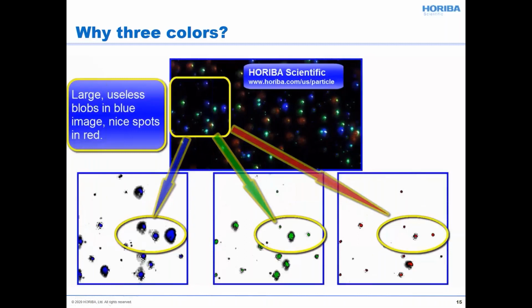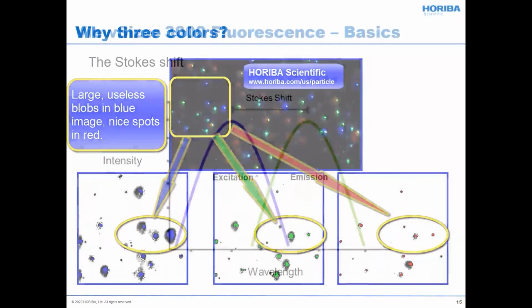And then again, the lower power laser really helps you identify what's happening with your larger particles in a sample. So if you have a range of particle sizes, the take home is that you really can't pick one laser power and suit everything. You need to have multiple powers, which means multiple simultaneous lasers.